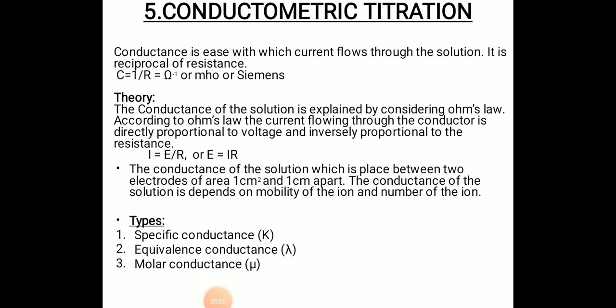Hello everyone, welcome back. So now we'll start with the next experiment, that is conductometric titration. Conductometric titration is nothing but the titration in which we get the end point as the conductivity changes, as the conductance changes. So it is the titration in which the end point is determined by change in the conductance.